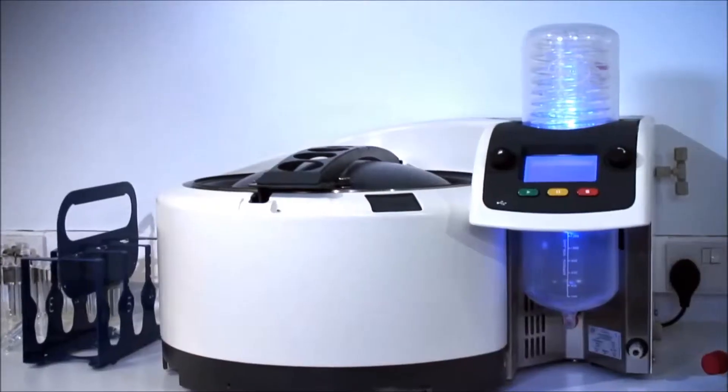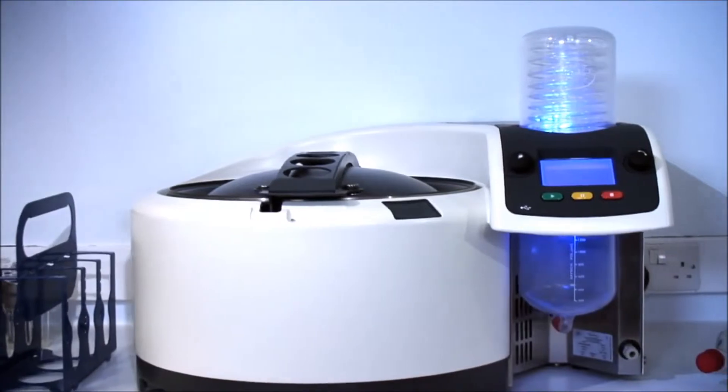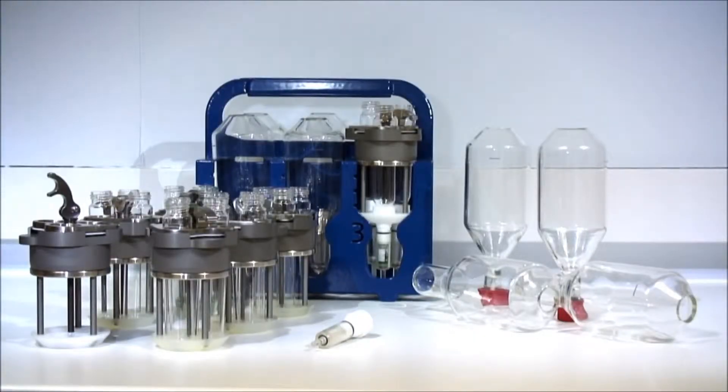There are two main systems. The Rocket was primarily designed for the evaporation or concentration of multiple samples in parallel.